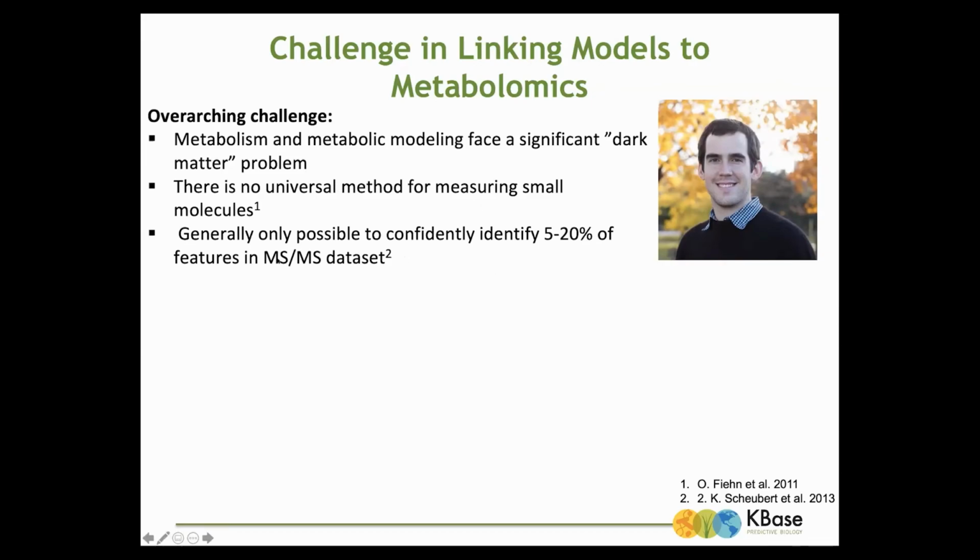But even if you have MSMS, you only get 5 to 20%. Why? Because the other 80% aren't in structured databases. MSMS identification relies on knowing a structure, predicting how it will decompose, and then comparing those predictions to your MSMS fragmentation pattern.